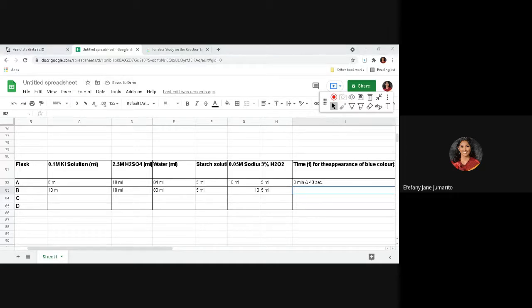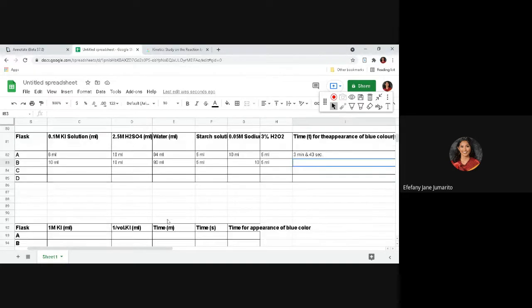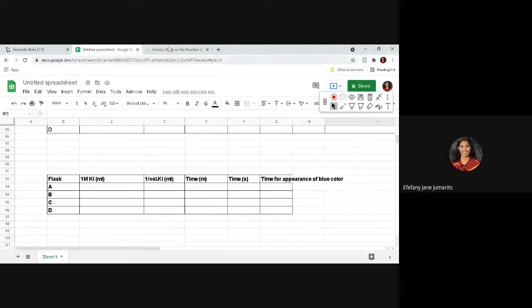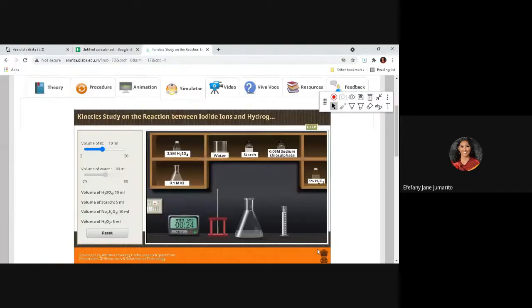Now also, more na table na sa inyong class question dito. Table 2, ma'am, kay pareha sa katong table na sa lab experiment katong sa ubos. Okay. Ito yung copy. Ito na siya ibutang sa Excel. Dito, magbuhat sa Excel. Okay, so nag-time. Mag-stop man yung time. Basta balhin ta. Okay, that's it.